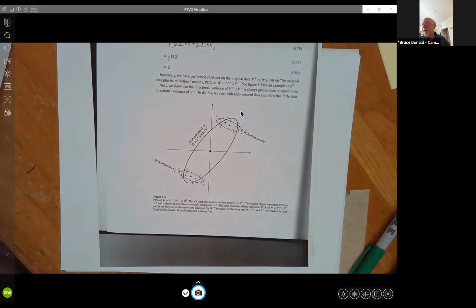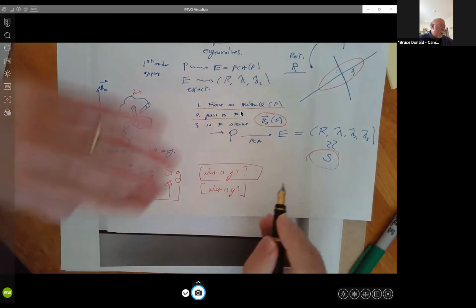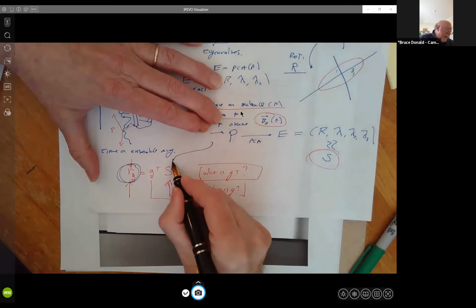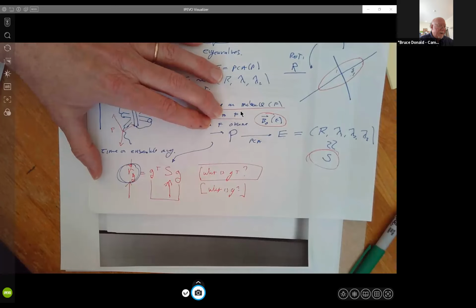The pictures will be, what they'll be trying to do is get at the algorithms. Now we've seen SVD and PCA, that's pretty cool. Well, what about this question here? When we've measured the dipolar coupling from experiments, we've estimated the alignment tensor by bootstrapping from an ideal helix geometry that gave us all the VIs. Then we use that ideal helix geometry to compute an approximate alignment tensor.